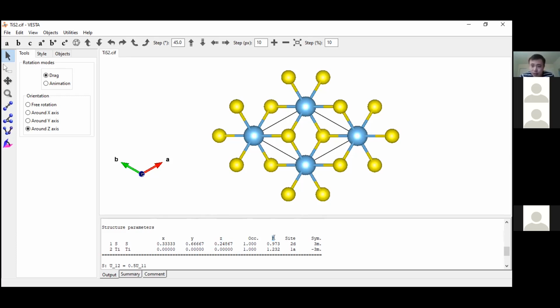In crystals, in fact, the atoms are not just staying still all the time. They are vibrating. They're deviating from the perfect, or we can call it equilibrium, position all the time. It's vibrating very fast, but it's still vibrating. And this thermal vibration causes some kind of disorder, sometimes referred to as thermal disorder. But there's another disorder, which is the static disorder, because not all the atoms are exactly at this position.